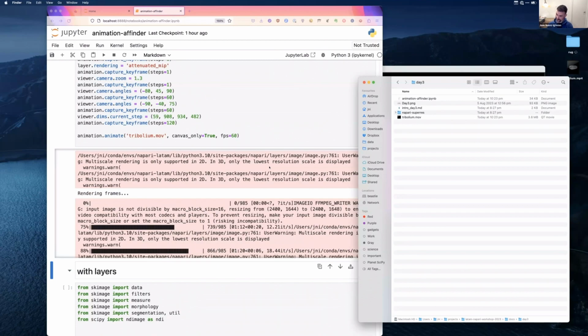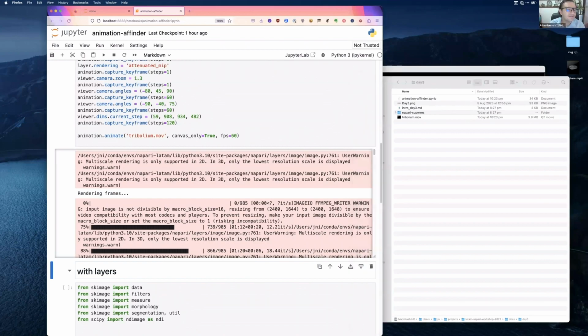So it's nice that there are all these abstractions, so Napari animation is not worrying about any Zarr file, only Napari is worrying about it. So that's really nice. Thank you. Yep.